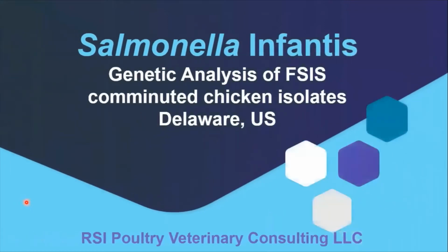RSI Poultry Veterinary Consulting LLC presents the analysis of Salmonella Infantis whole genome sequencing data generated from isolates recovered from comminuted chicken samples collected in Delaware.